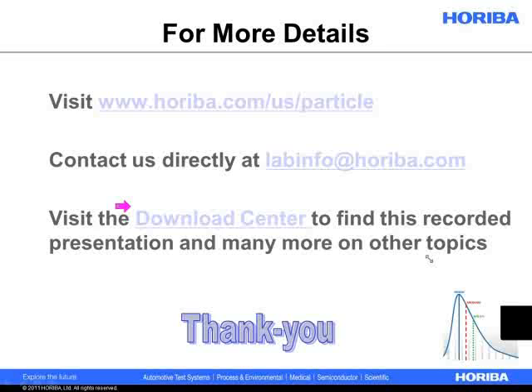We have a document on the website, another technical note. The exact technical number escapes me. I think it may be TN153, and I'll put that in the chat box. I think it's about understanding how to use chi-squared and R parameter values, or something like that. But it's in the technical notes section of the Download Center. I'd say definitely download that and read it, and hopefully that answers your question a little better than I can. If not, email us.